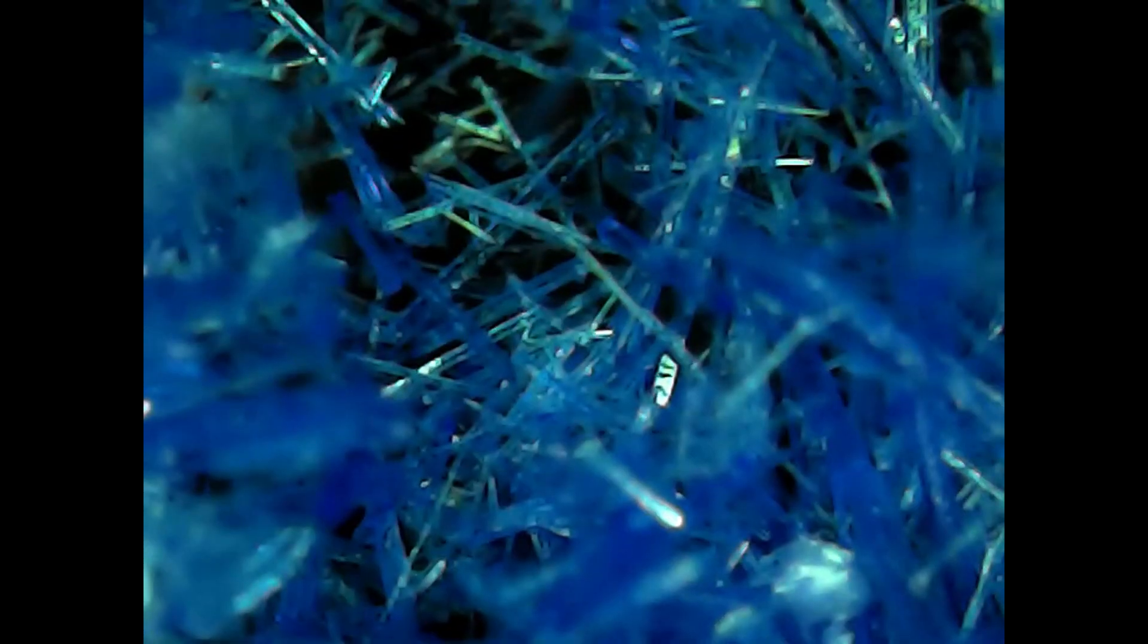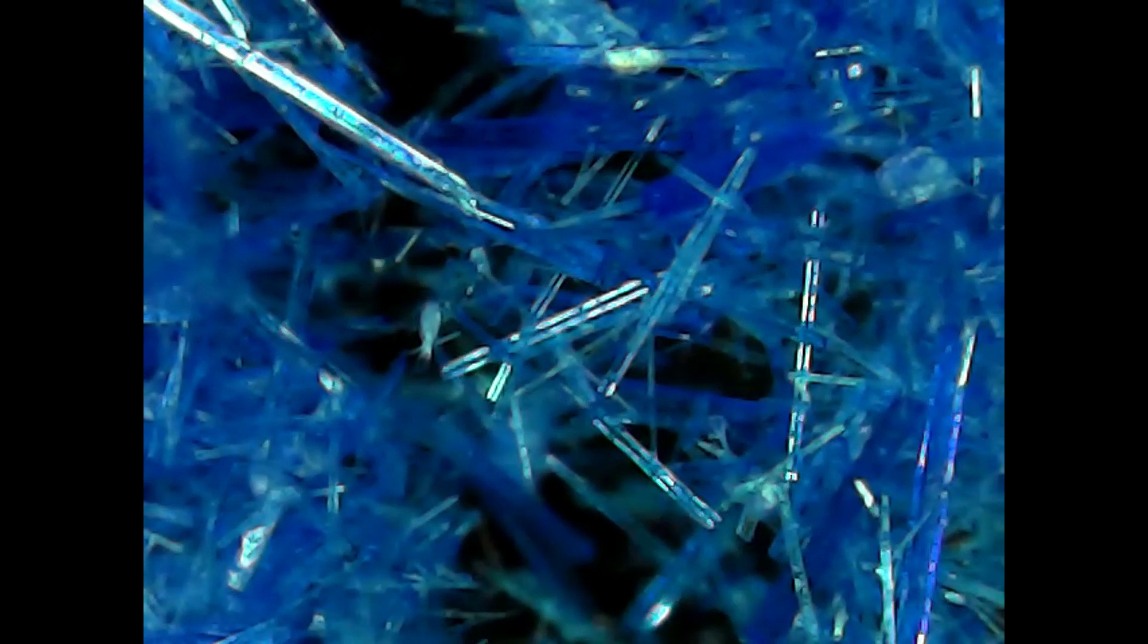To see the needle-like structure of the crystals better, I again employ my top-tier microscope. This joke definitely won't get old.